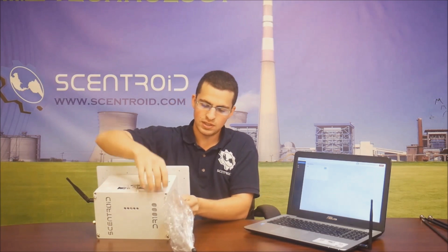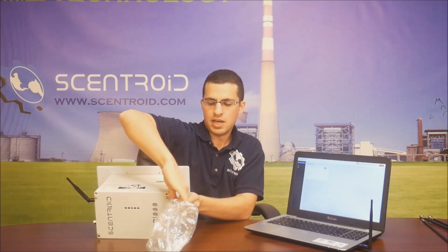To remove it, you want to hold the metal ring back and pull it out by pulling on the tube. And that's it.